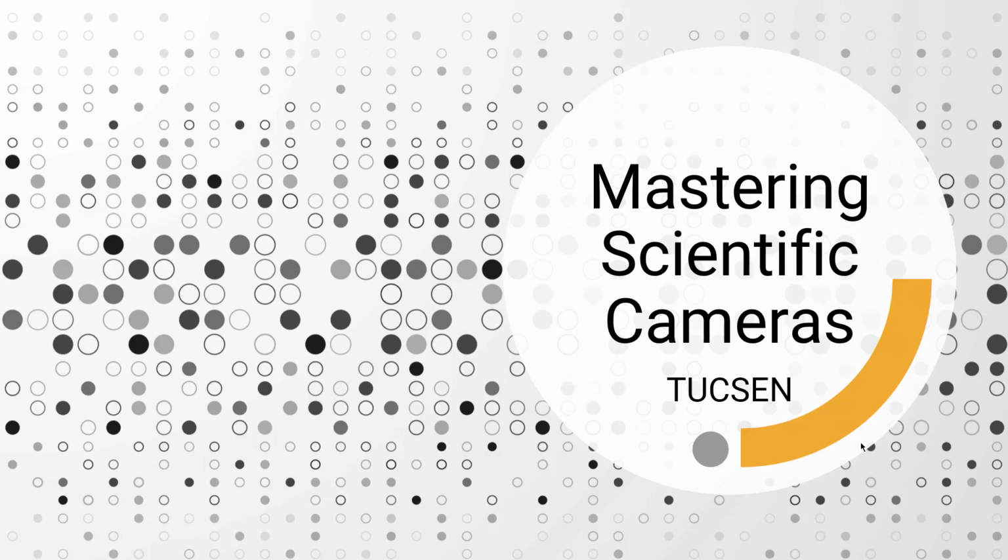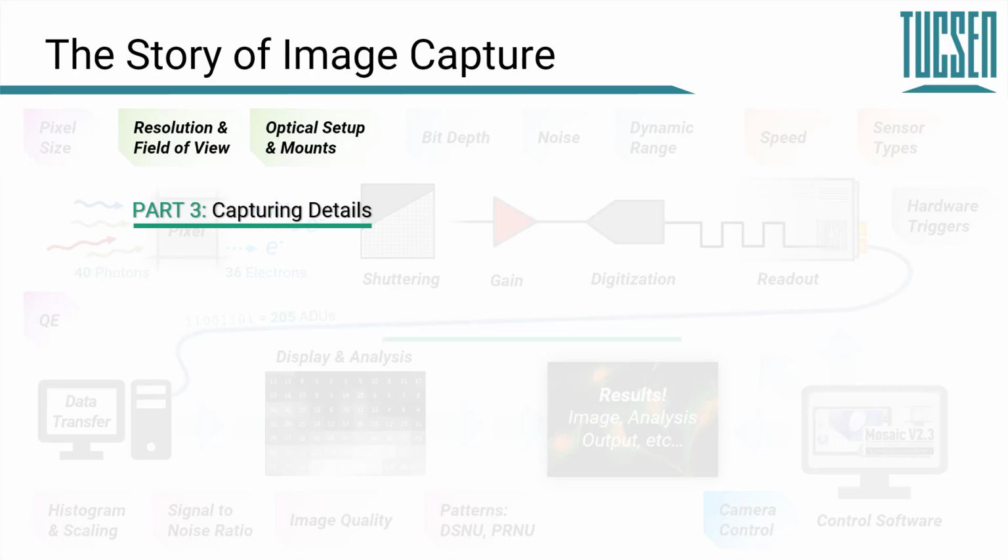Welcome to part 3 of the Mastering Scientific Cameras course from Tucsen. In this part, Capturing Details, we're going to be examining resolution and field of view.